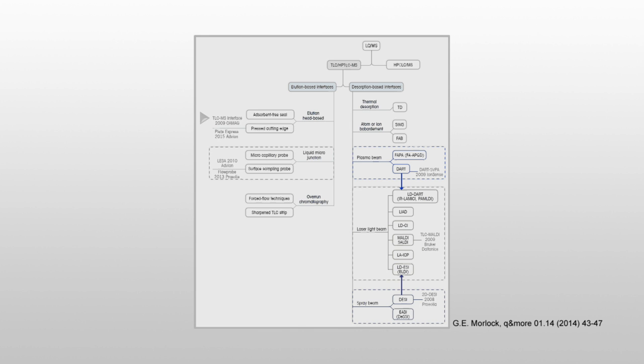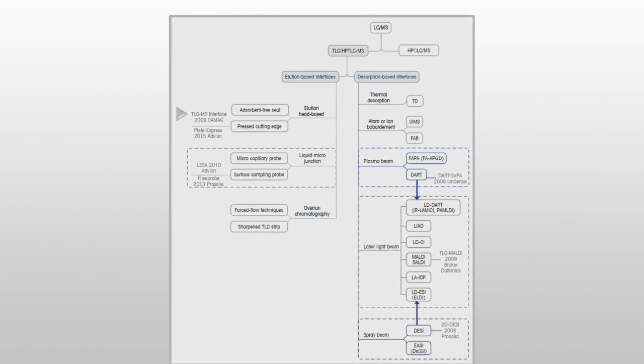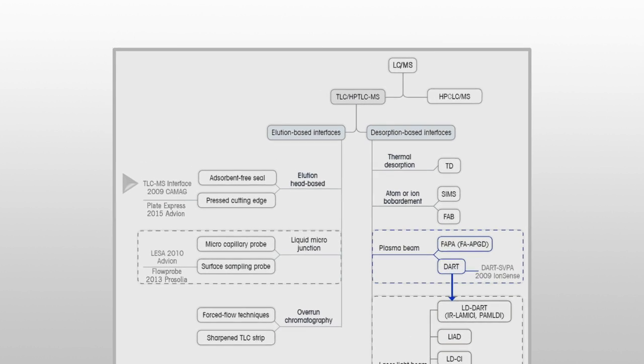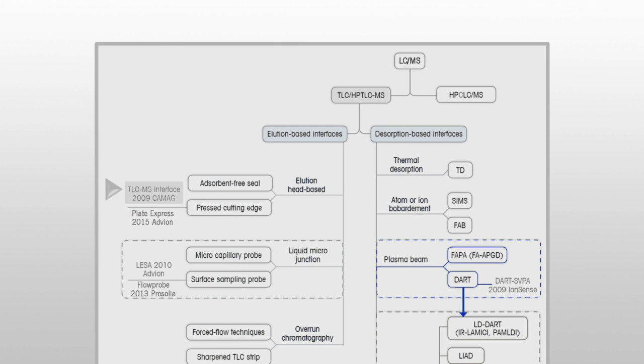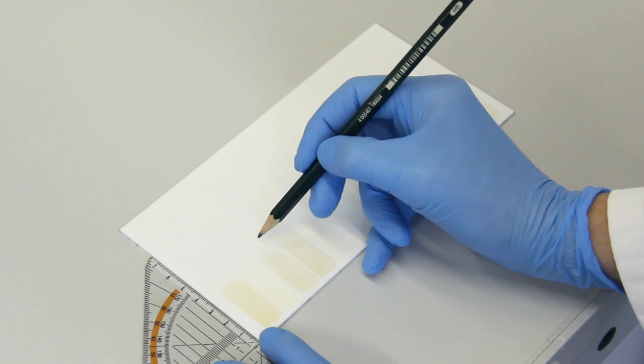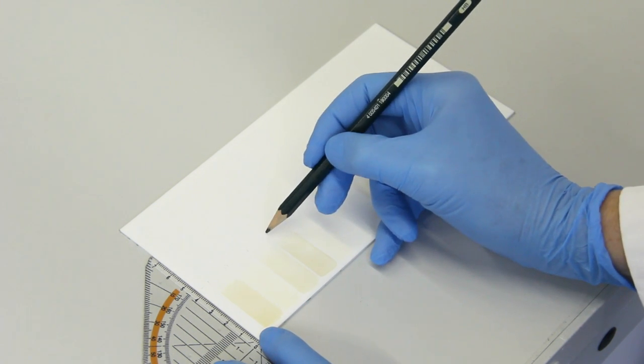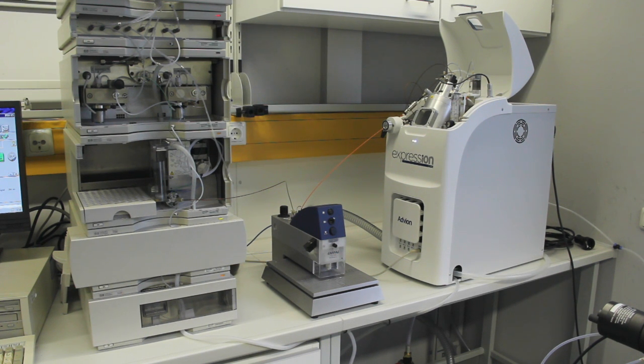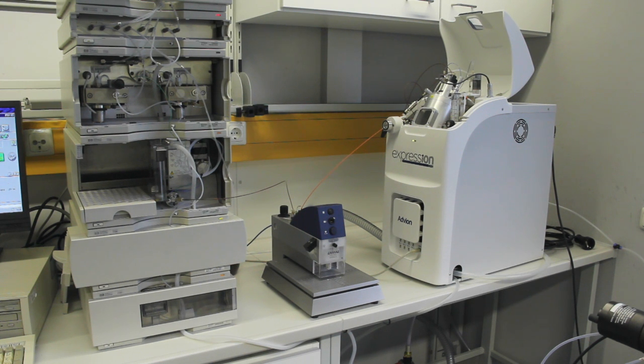Mass spectrometry followed. The elution head-based TLC-MS interface, marked gray on the left side, was used for elution of zones of interest. Estrogen-effective zones were marked with a soft pencil, and the TLC-MS interface was connected with a single quadrupole mass spectrometer. Of course, a high-resolution mass spectrometer is recommended for characterization of unknown bioactive compounds. However, it was not available.